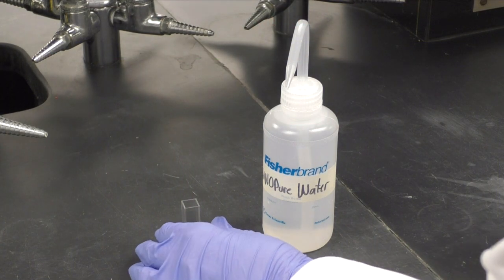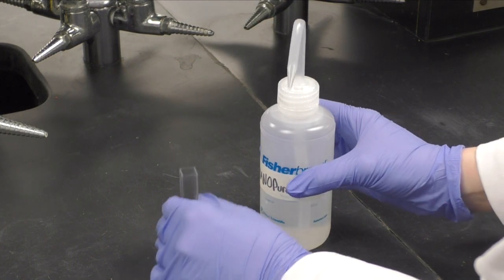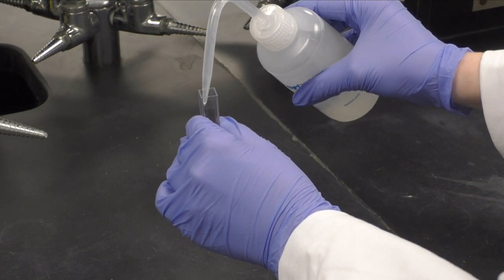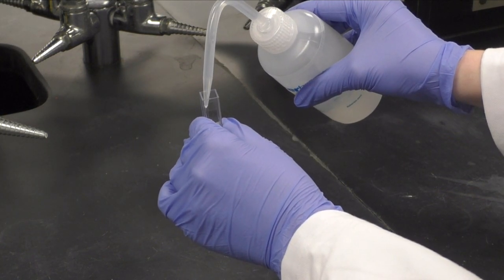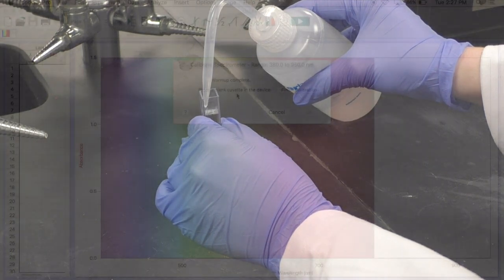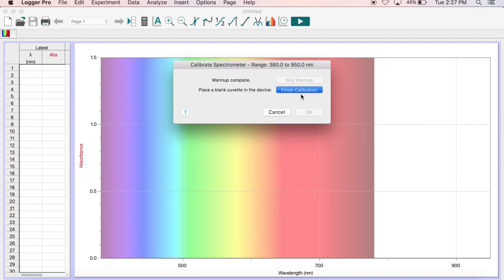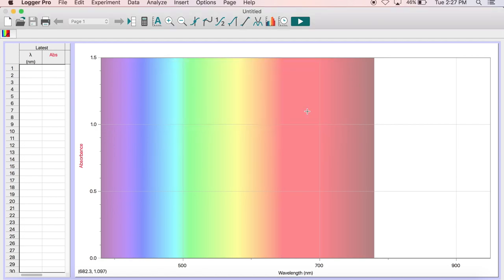While you wait, fill a clean cuvette about 2 thirds full with Nanopure water to use as a blank. After the 90 seconds is up, place the blank cuvette in the spectrometer, select Finish Calibration, and then OK.